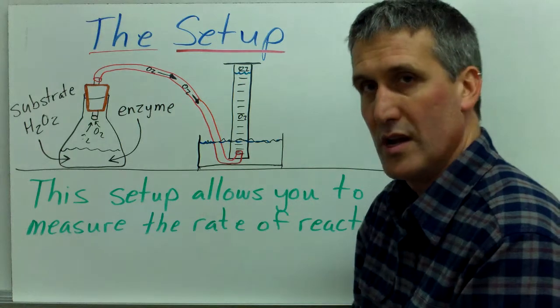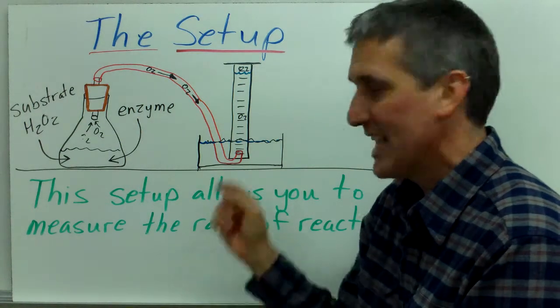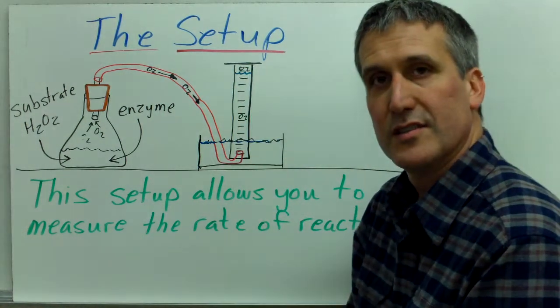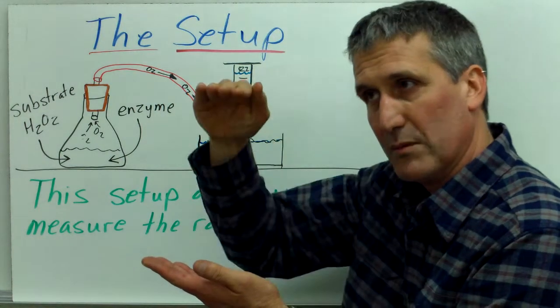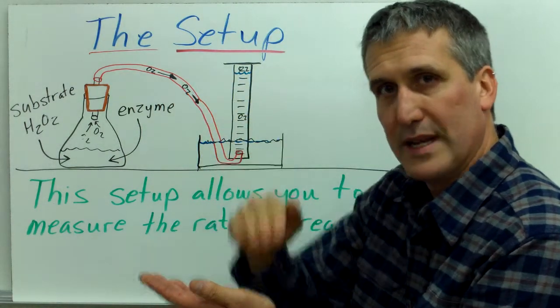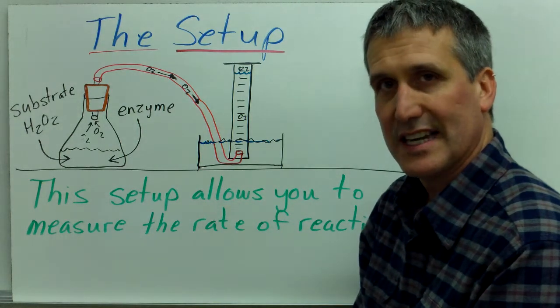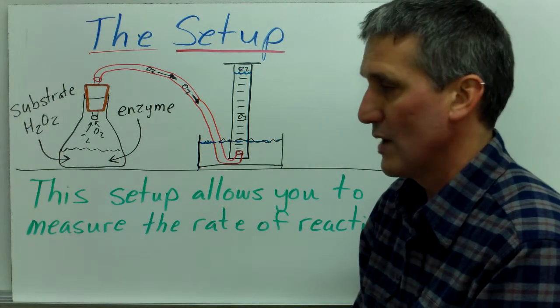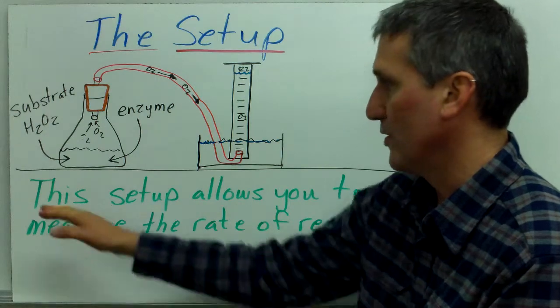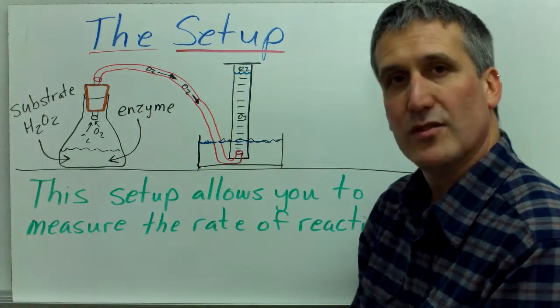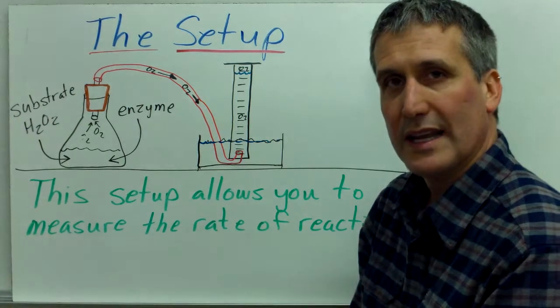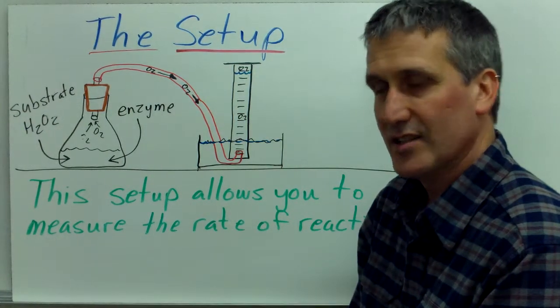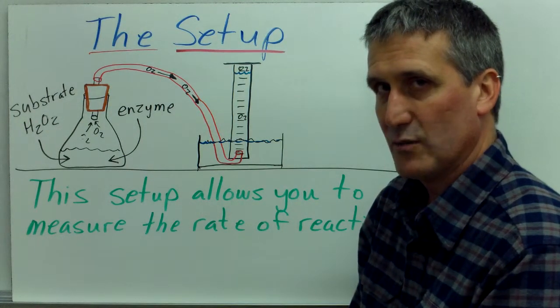We have a graduated cylinder filled with water and turned upside down in water. So, when the oxygen gas bubbles up into this graduated cylinder, it will displace the water, and we'll be able to see the water being displaced as the oxygen gas accumulates in the graduated cylinder.